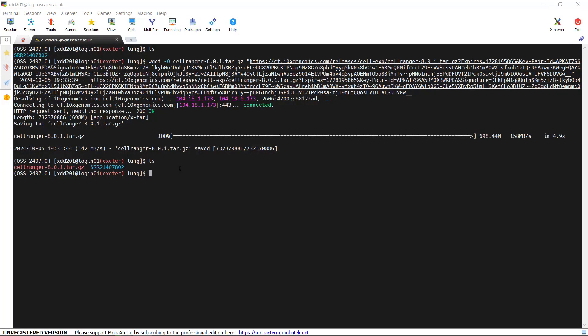In the next step, we can use the tar function to unzip the software. So we paste the tar command and run it to extract the CellRanger software.